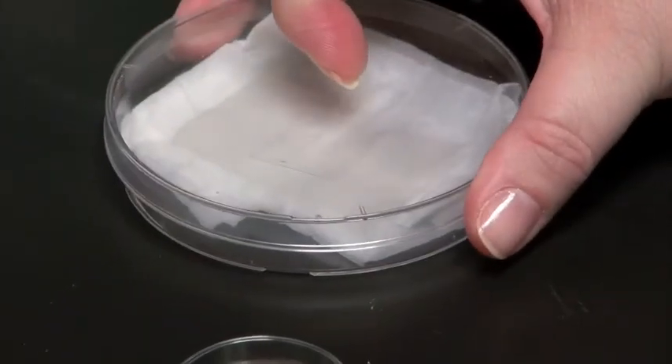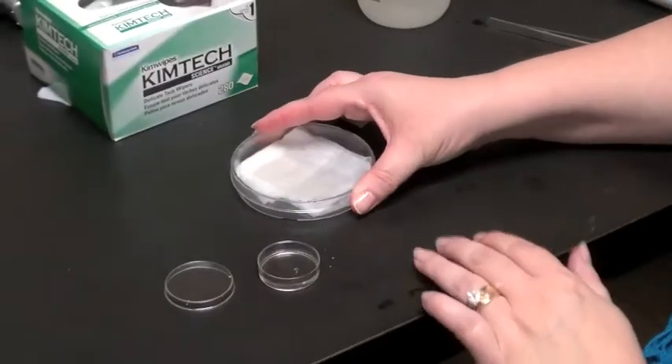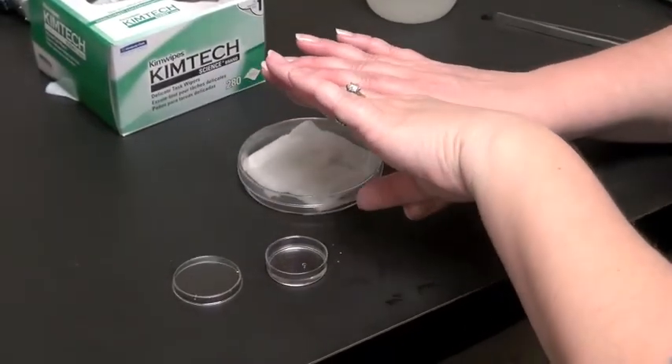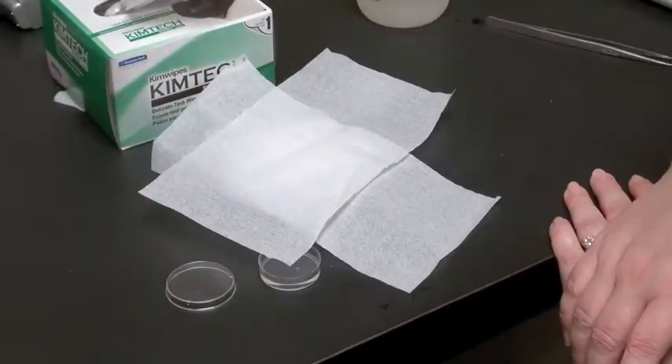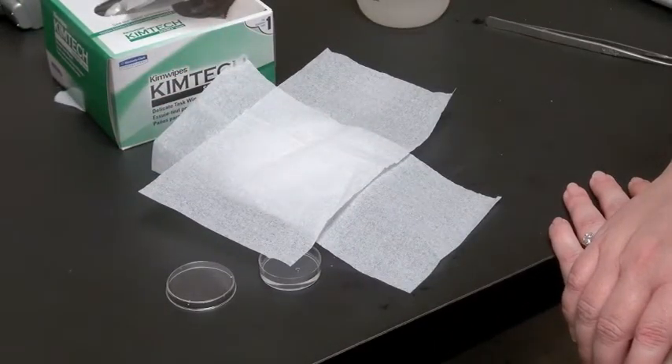If this is a fluorescent dye or stain, then you'll want to put it in a drawer or cover it with some type of light-blocking material, either towels or aluminum foil.